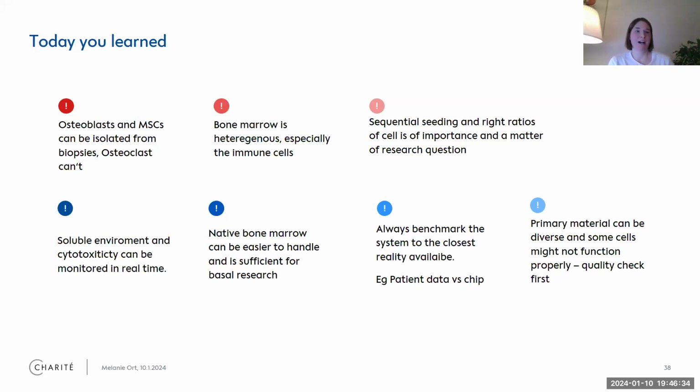It's really a waste of time if you don't do the extra step, go all the way in 3D, and after 42 days you realize, oh, they never lived a good and healthy life, those cells in my chip. So do pre-testing, go the extra mile, and then have a sufficient system to answer your question. And sometimes it doesn't even answer your question, but that's just the thing with organ-on-a-chip technology. We're still kind of in kindergarten when it comes to those things.